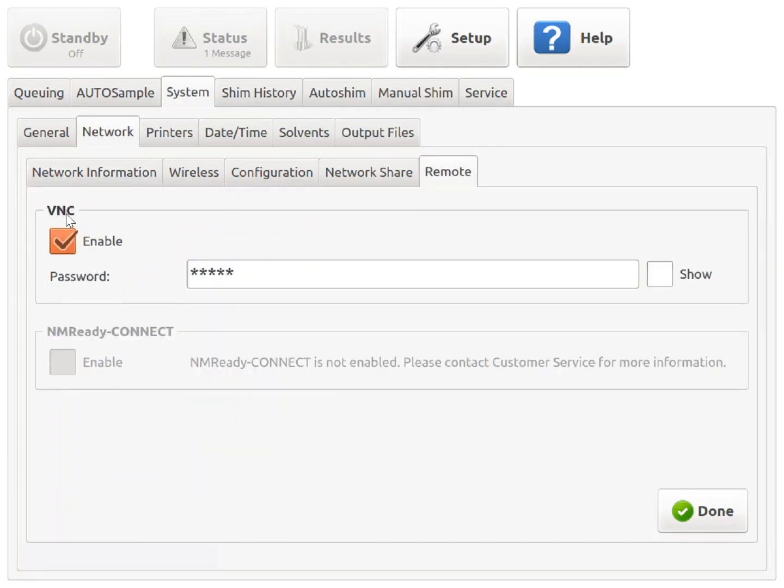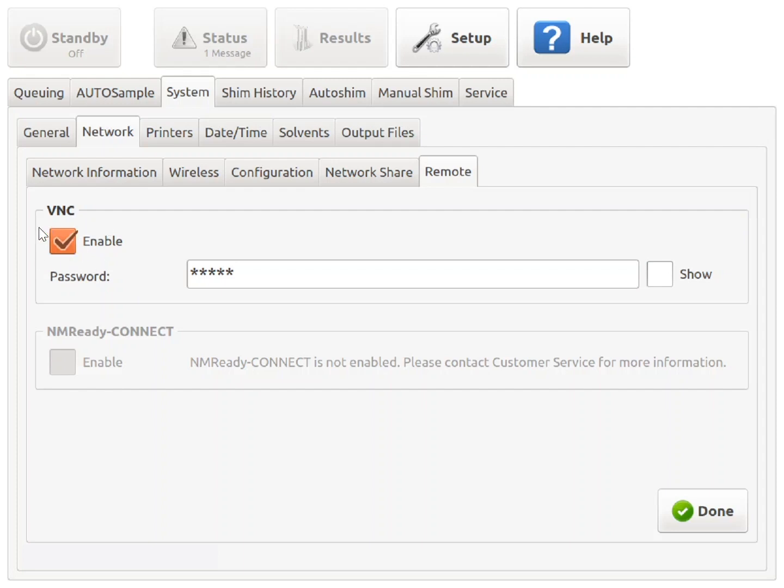From this screen, enable the VNC connection and enter your own password if preferred. If the VNC option is not enabled at this time on your spectrometer, please feel free to check this box and enable it. Checking the Show box will allow you to see the current password, which will be used to connect to the instrument using UltraVNC shortly.